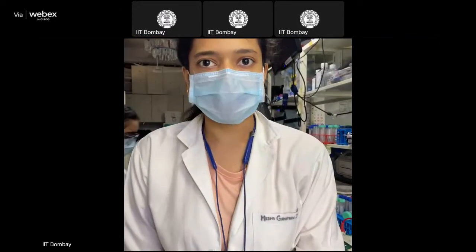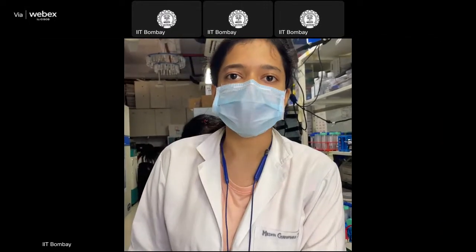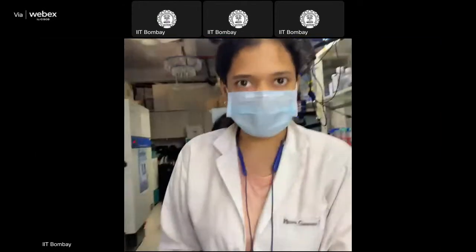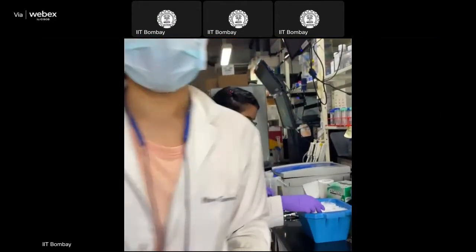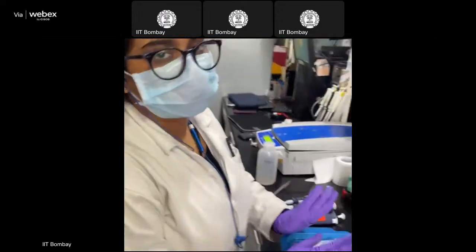But today we are going with a cumulative approach. We are not going to select a band. We'll be taking the whole lysate and performing in-solution digestion. This is also a concept that you learned recently, so Shashwati will be demonstrating that.